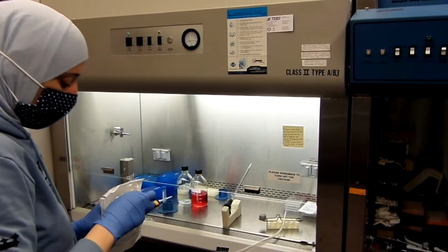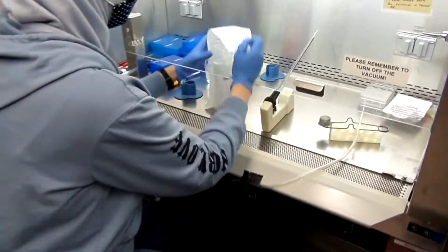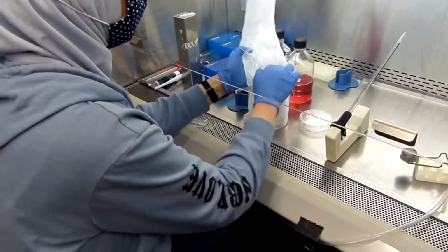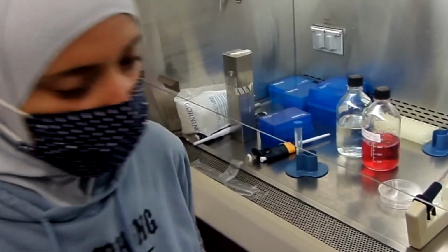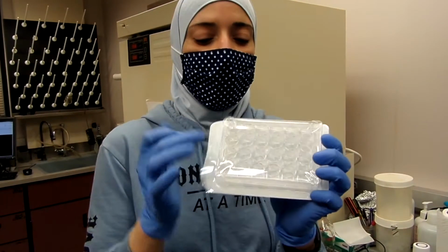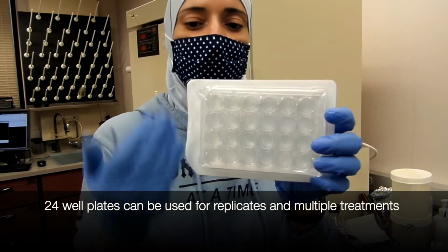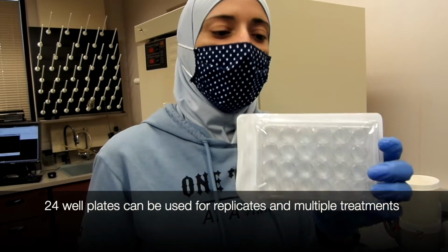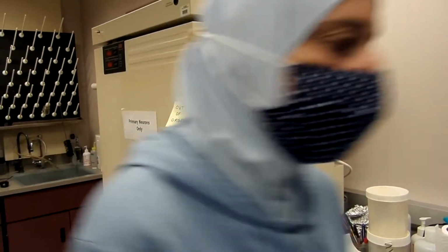So these are tissue culture plates. Everything is sterile. So you will open it here. And also I want to grow the cells in 24 well plates. I will bring one. This is a 24 well plate. It has 24 wells, and we use such a plate if we have different treatments so that we can have duplicates or triplicates of the treatments.